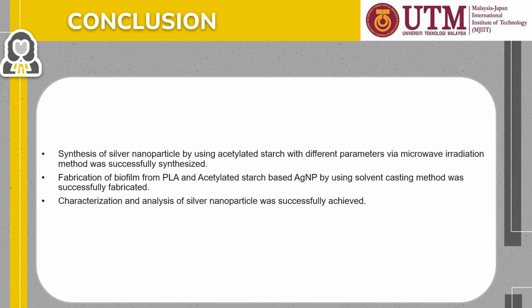So finally, we come to the conclusion. Basically, as for the conclusion, the synthesis of silver nanoparticles using acetylated starch with different parameters via the microwave irradiation method was successfully achieved. And the fabrication of the biofilm of PLA and acetylated starch-based silver nanoparticles using the solvent casting method was successfully fabricated. And lastly, the characterization and analysis of the silver nanoparticles was successfully achieved.